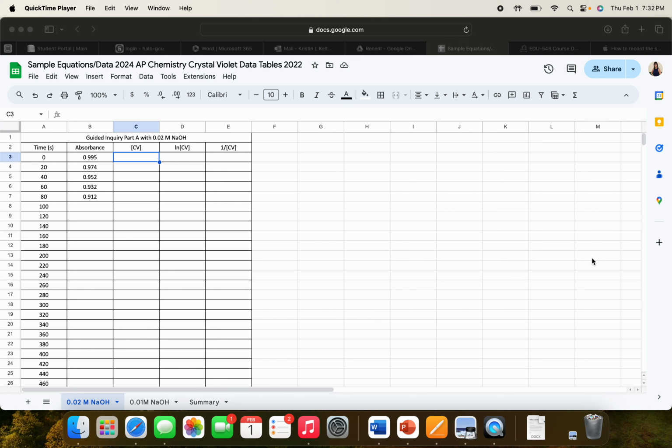Hey, AP kids. So let me show you how to make the formulas here in this thing. I've never done a QuickTime Player, so fingers crossed this works. It's just an audio file. But over here you have your absorbances. And by the way, I'm pretty sure those don't go there. Let's move those down a minute.